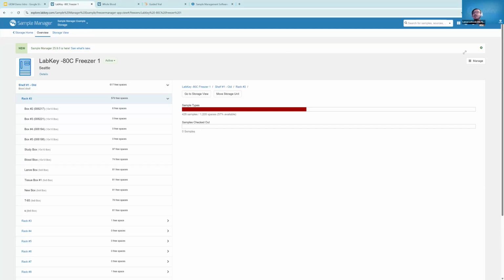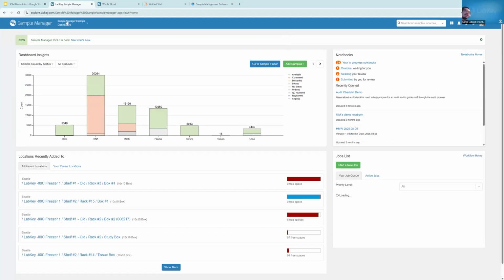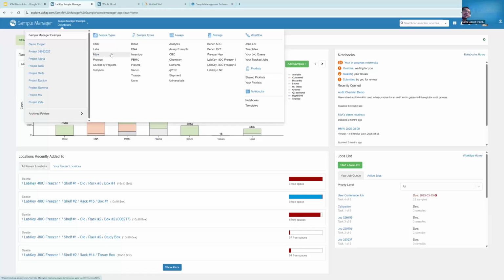Cool. Can you load donor medical information? Yes. So there's a couple of ways you can do that. You can have donor medical information, the source types, assays, if you need it there, you can import it manually through a file upload like a spreadsheet, or you can do it through API. So if you have like REDCap, other kind of donor databases, you can do that.